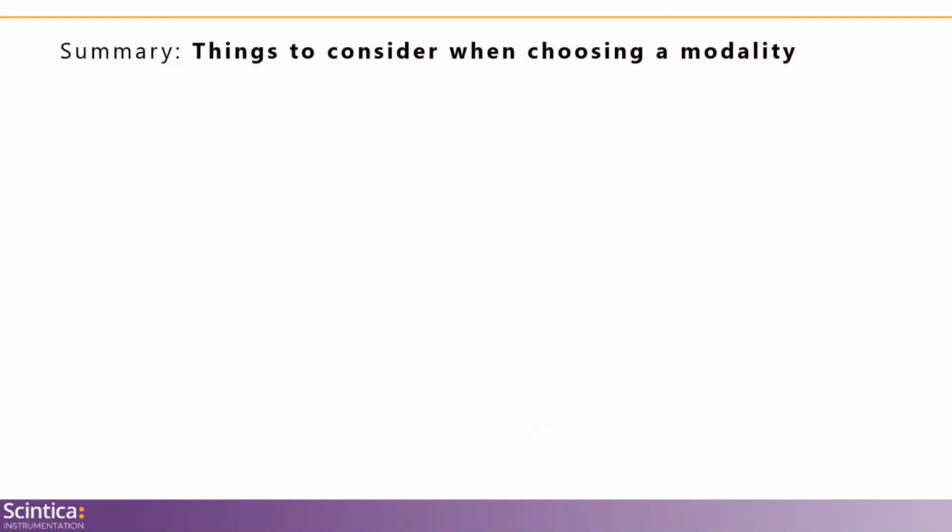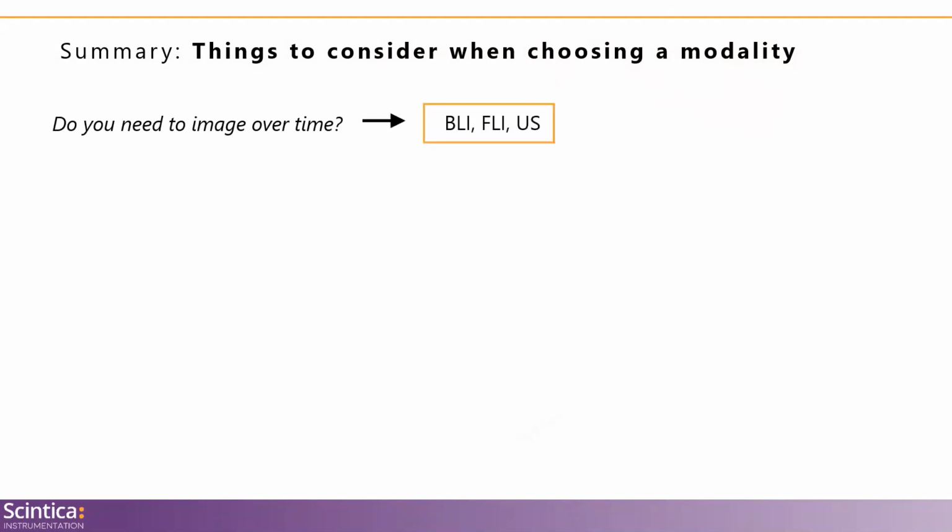Great. Thanks, Tanya. Now, just to finish up, I promised you we're going to get you out in time for lunch. But just to summarize, I wanted to go over a couple things to consider when choosing a modality for a study. And so these obviously aren't all of the questions I would ask, but this is a good place to start. And so the first one that comes up often is, do you need to image over time?